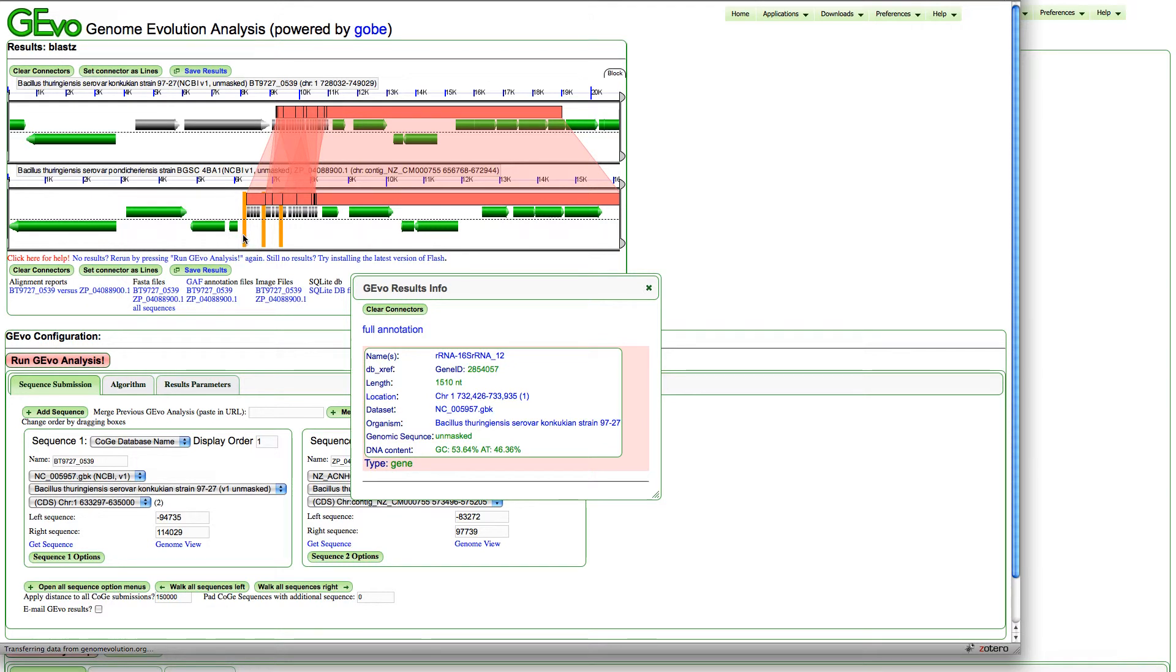These orange bars represent unsequenced regions of the genome. When you do shotgun whole genome sequencing and use assembly algorithms, large, highly repetitive and highly similar sequences like ribosomal genes are very difficult for the algorithms to process, so they often get left out of the assembly.